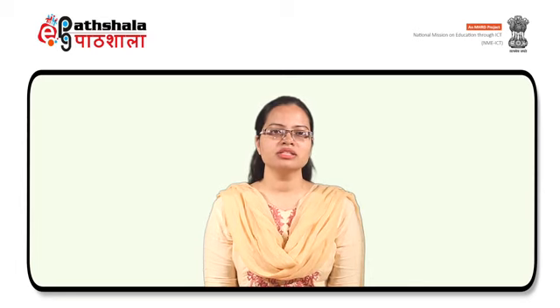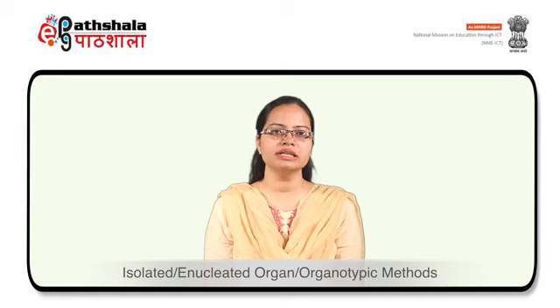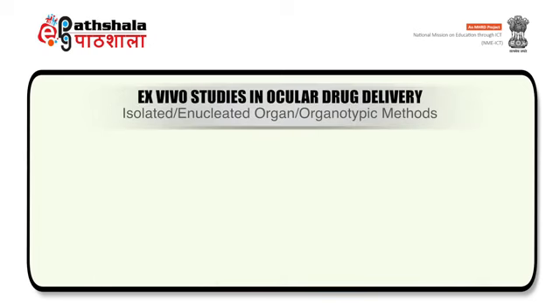Thus, all manufactured consumer products and their ingredients need to be tested and their eye irritation potential must be assessed to ensure that the risk associated with the products meets suitable safety criteria and are clearly labeled. The ex vivo tests for substances meant to be administered by the ocular route are broadly categorized into two categories. First, isolated enucleated organ organotypic methods. Second, non-organotypic methods. Now the first is isolated enucleated organ organotypic methods.